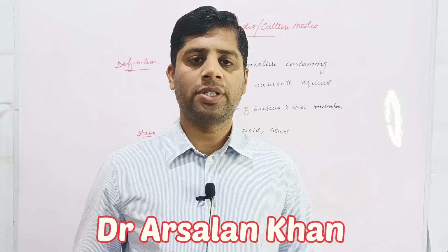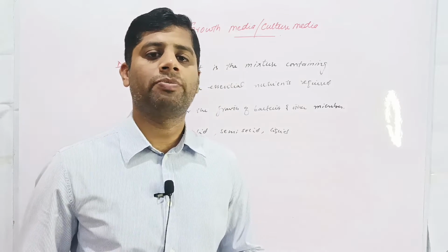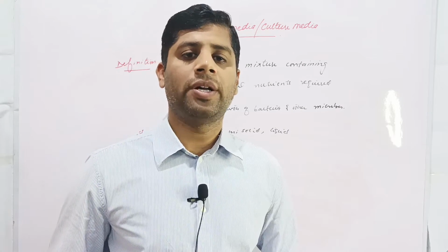Hi, I am Dr. Arsalan and today we are going to discuss the preparation of culture media or growth media for the growth and proliferation of microorganisms. In this lecture, we will learn the preparation of media theoretically as well as practically in our lab.